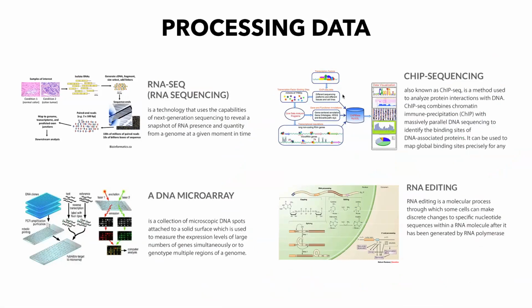We can also use ChIP-seq or chromatin immunoprecipitation that we can analyze interaction between a certain target protein, for example, histones, or different components of histones, and how we can then study peak calling and understand epigenetic variation related to histone modification.